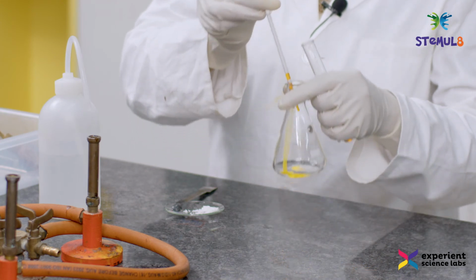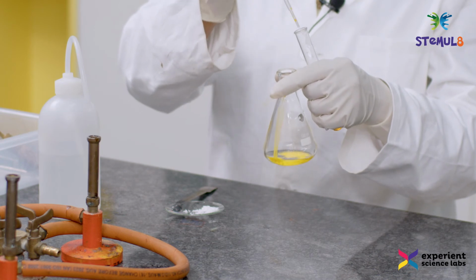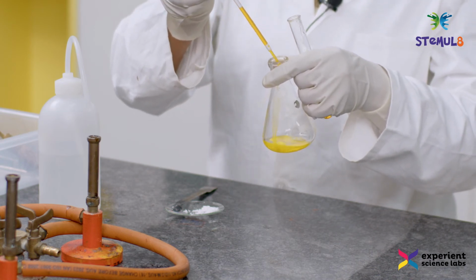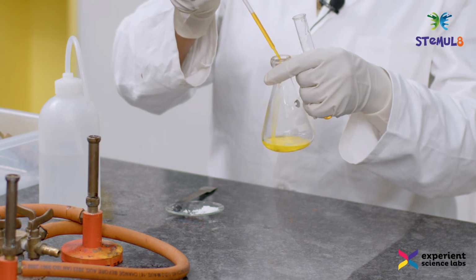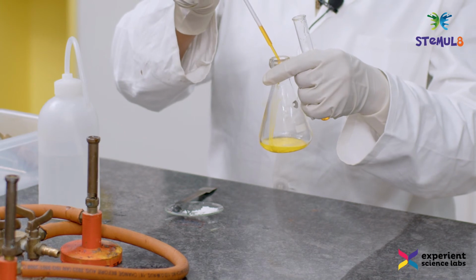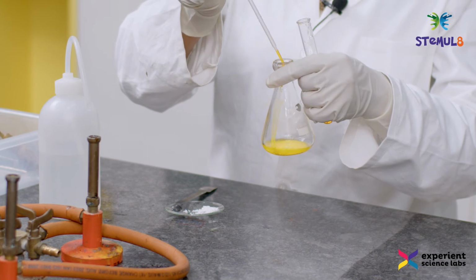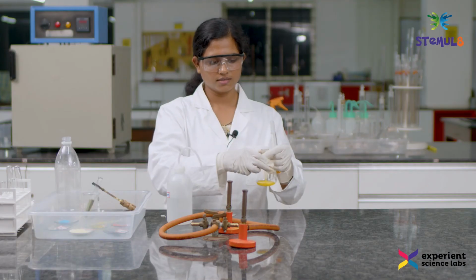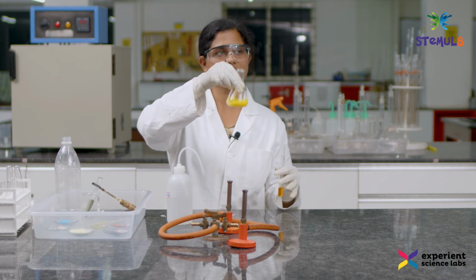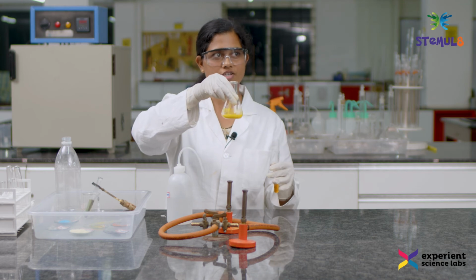Do you see a beautiful yellow precipitate getting formed? Yes, this is an indication that the displacement reaction has taken place and the ions have exchanged with another salt. This beautiful yellow precipitate is lead iodide, which has formed due to the double displacement reaction.